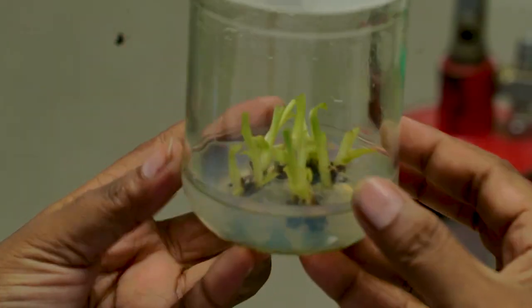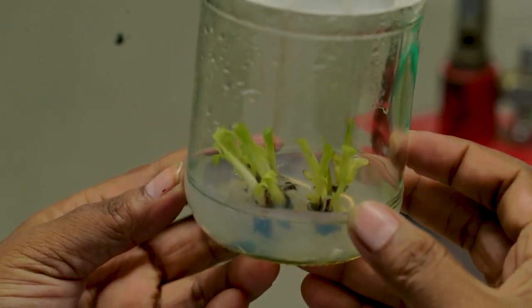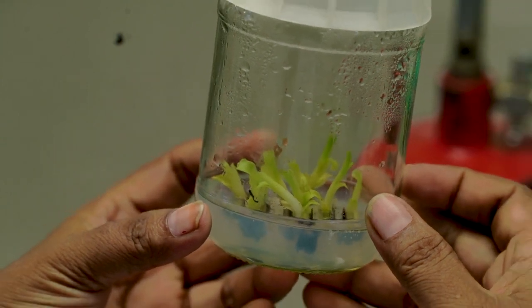So again, after 24 to 30 days, this will be ready for the next subculture. In this way, we can continue subculture 8 times.